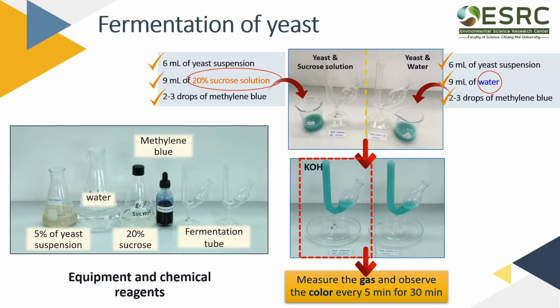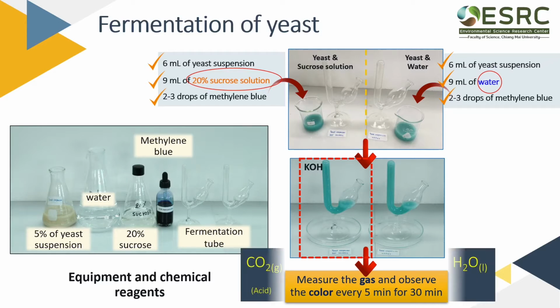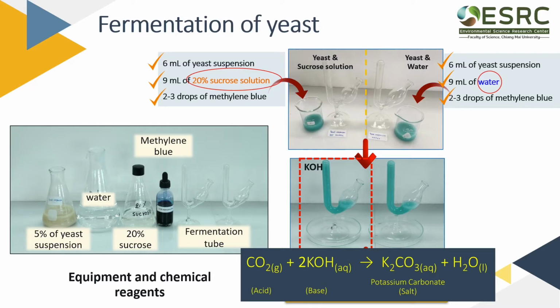and observe the gas volume. Potassium hydroxide is a carbon dioxide absorber: potassium hydroxide is a strong base, and carbon dioxide is an acidic oxide. So, the two readily react to form potassium carbonate, a salt, and water. That's why potassium hydroxide was used in this experiment.